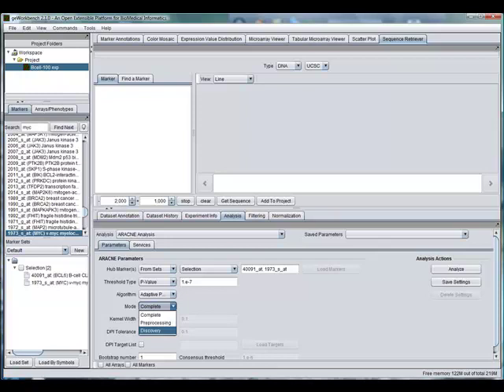Discovery mode calculates mutual information with this run and uses pre-calculated parameter files as needed if they are present. Complete mode combines both pre-processing and discovery. Since we already have the pre-processing run before, we just need to set up as discovery.